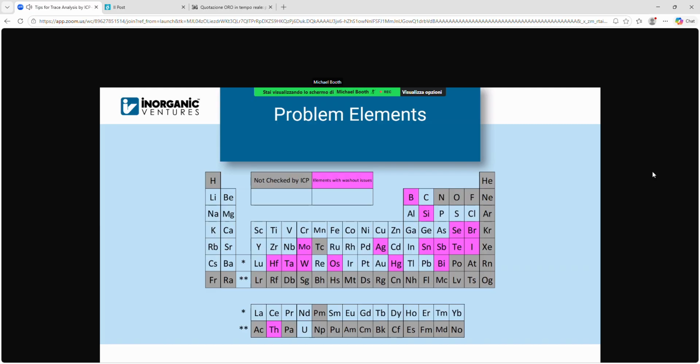And again, same thing. Silver can be a little bit sticky. If HCl is present, especially at low concentrations, you might have issues with that. But a lot of it is just dependent on the actual chemistry of your rinse solution, and some of it is dependent on the affinity towards the plastic. So some things like bismuth, for example, are really sticky. It seems to stick particularly to the PVC pump tubing, if your sample is running through PVC pump tubing around the pump of the instrument. So that's just an area that can kind of hang out. So it's mainly the chemistry or the specific affinity towards the plastic tubing.